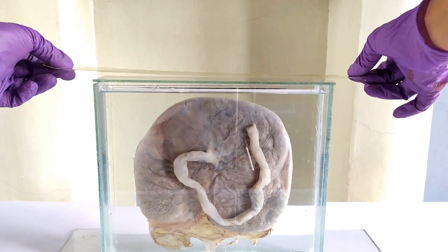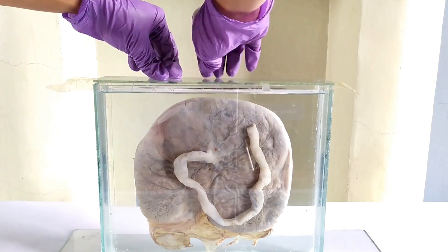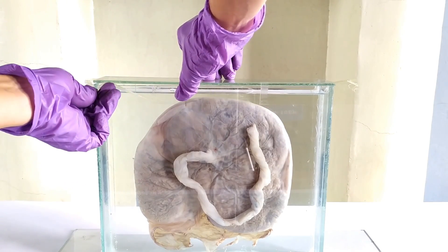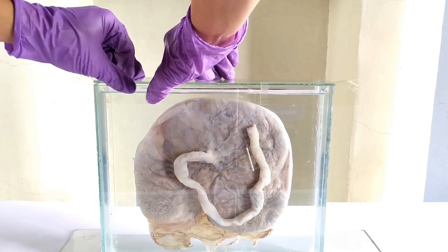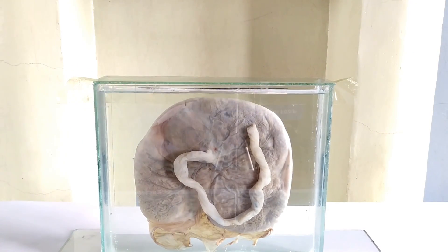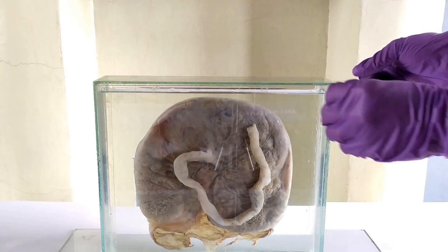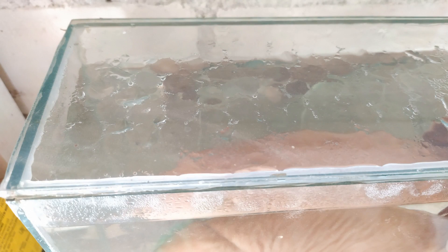Now seal the lid of the container temporarily using cellophane tape — this has been covered in detail in my calf specimen preservation tutorial video. You might have to change the preservative once or twice over the course of a few weeks to a few months to achieve a clear display, once any further discoloration ceases to occur and the preservative liquid remains more or less clear. You can seal the lid permanently using silicone sealant, or simply stick with the temporary cellophane tape seal, which will anyways last for a few to several years.